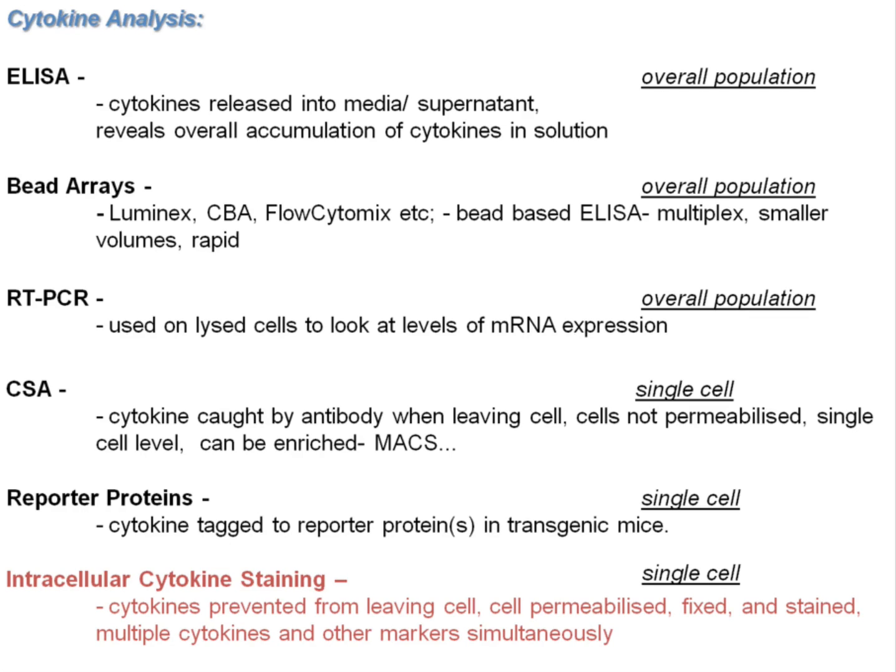It can be a little bit technically difficult, and as far as I know too, there's just one company at the moment, Miltenyi, that do this technology. In my experience, it's not a very used technology, but it is something to be aware of, and I guess the greatest thing about that is you can keep the cells alive and somewhat untouched.